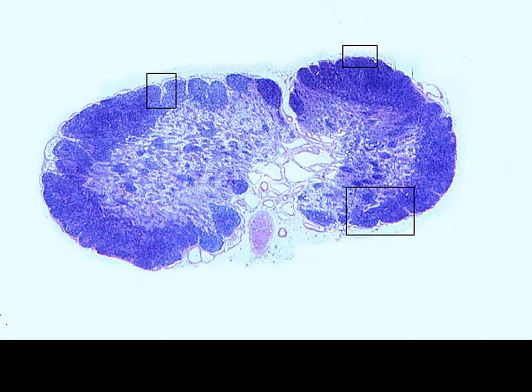Now, our encapsulated lymphatic tissue begins with our lymph nodes. And in our lymph nodes, we're going to see that in the hilum, we have a lot of very thin-walled vessels, no red blood cells present here. These are going to be our efferent lymphatic vessels.